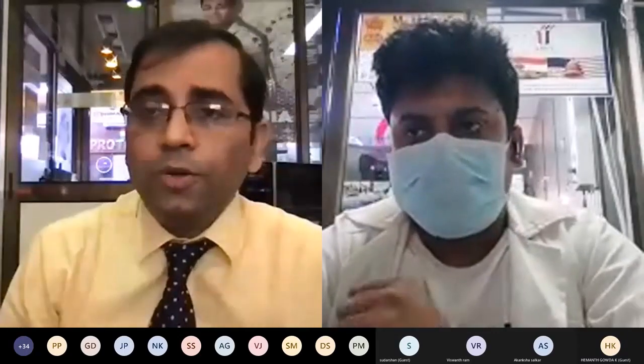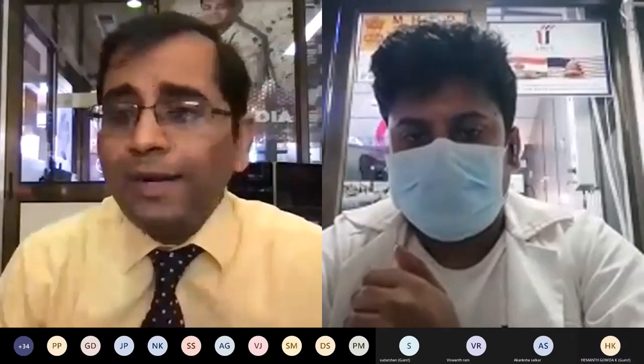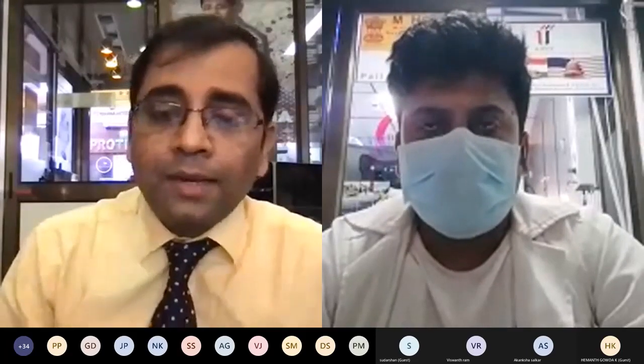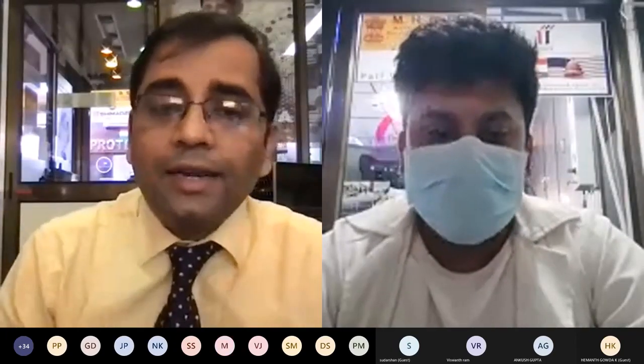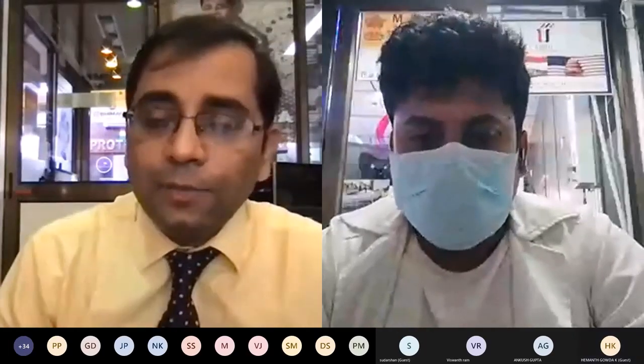We will see how best we can take this type of analysis forward, because what we want at the end is that you take some small things from the course, but are confident about doing those things, right? Like, can you now say that, okay, using MaxQuant, I can analyze my simple file for in-gel digestion or identifying the proteins of interest?